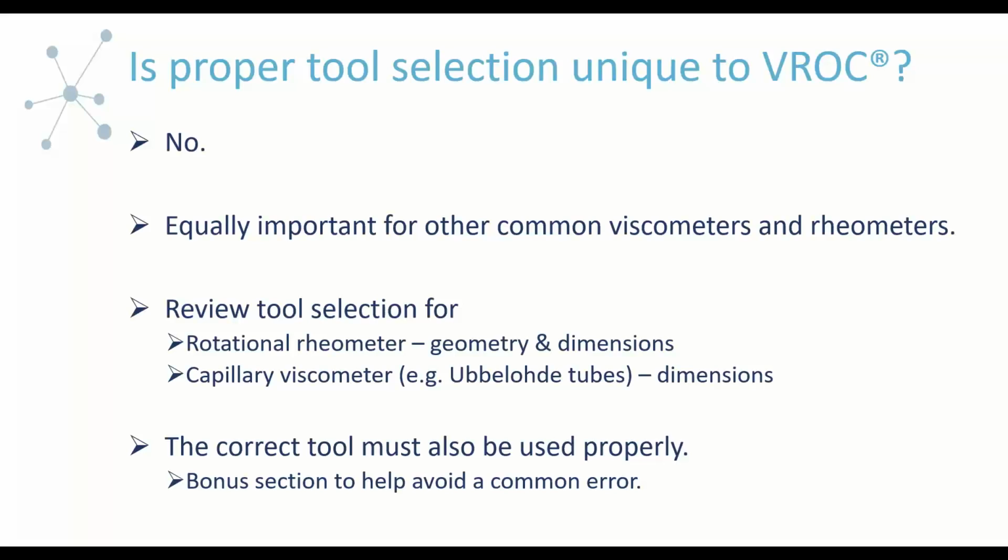And we see this a lot when we do some of our consulting. This is a common mistake people make when they're new to the field. And it's just sort of a little bonus section where we go through a way of using the tool properly. And then what it will really be focused on is doing these very low shear rate measurements, where if you don't use the tools properly, you can generate a lot of poor data.